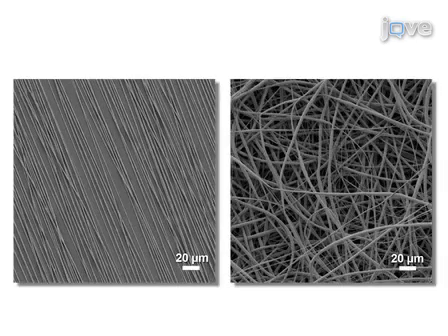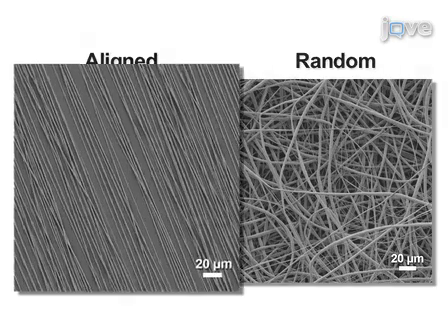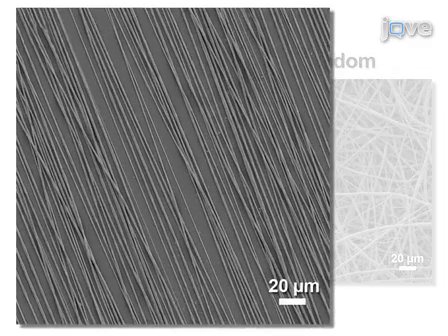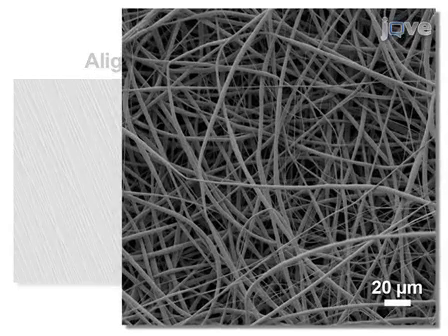This SEM image illustrates the typical morphology of aligned and random electrospun fibers. The fiber alignment is manipulated by the choice of the collector. Note that fibers spun onto a rotating wheel collector are uniformly aligned. In contrast, fibers spun onto a stationary collector have a random morphology.